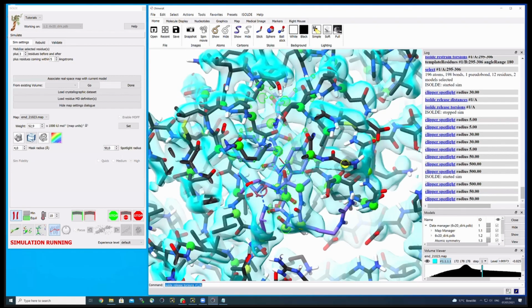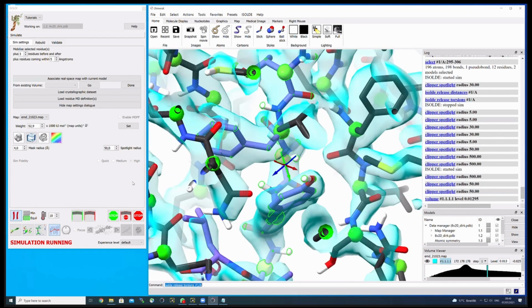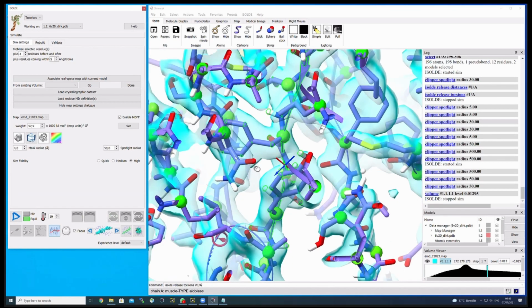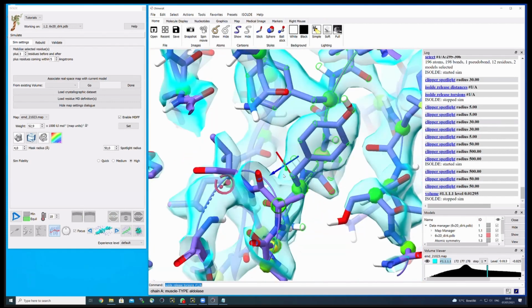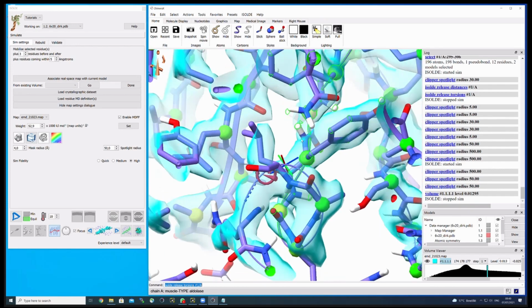And then of course there's also the threshold that you can change that helps you a bit to adjust to the local area. Yes. Okay, and with this, basically, I think you are free to delete more or less the entire model of one of the copies, except for maybe a very prominent residue pair somewhere in the center, like a tyrosine coupled to something else, and start building de novo the entire protein of one of the copies, essentially yourself, I would say.